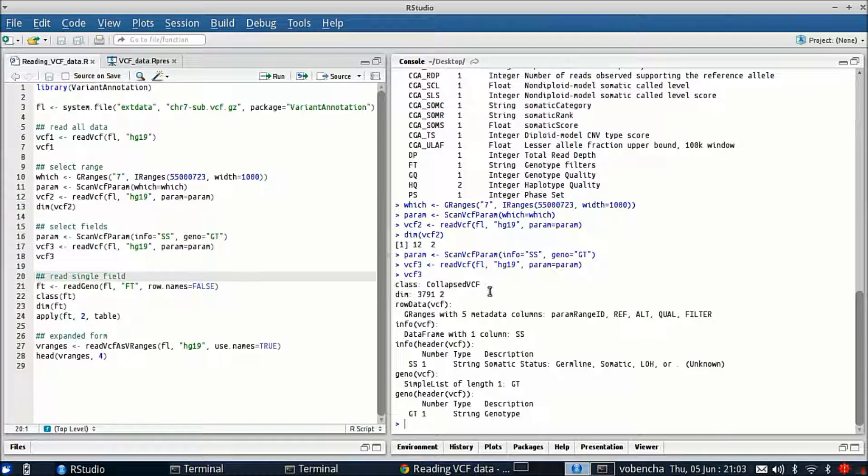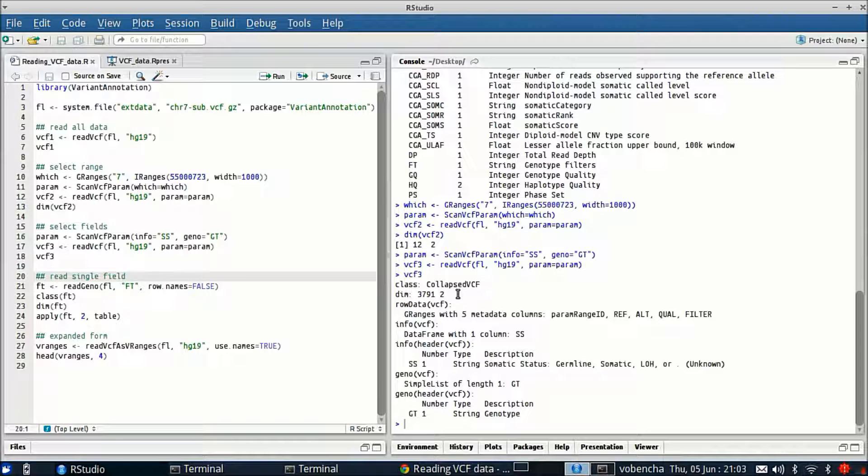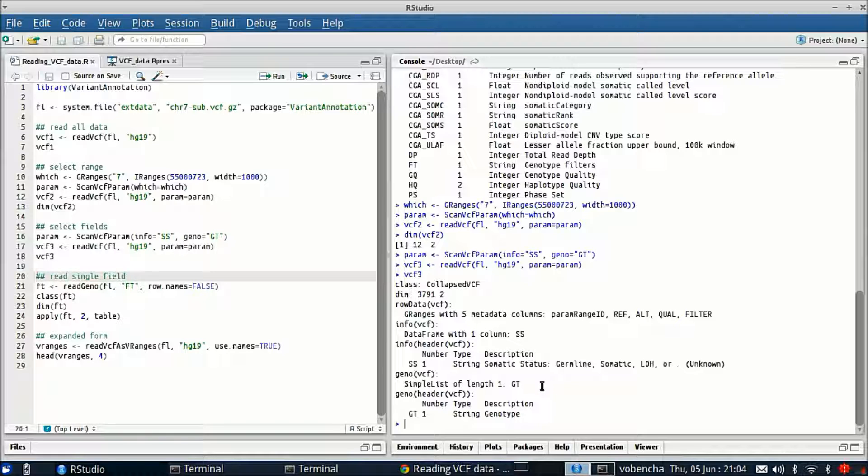Now we see we have the same dimension as our first VCF because we've subset by field and not by position. So we have all variants in this object and the difference comes here in the info. We have a data frame with one column RS and we have one genotype variable in the geno slot.